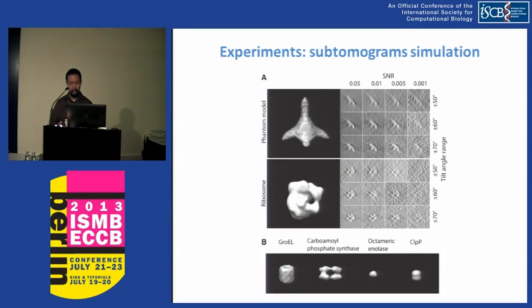At each distortion level of the subtomogram image simulation process, we generated 100 subtomograms containing instances of a structure with a random rotation and translation. To simulate the crowded environment, we add surrounding neighbor structures to a subtomogram.